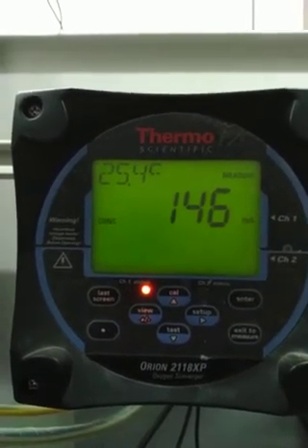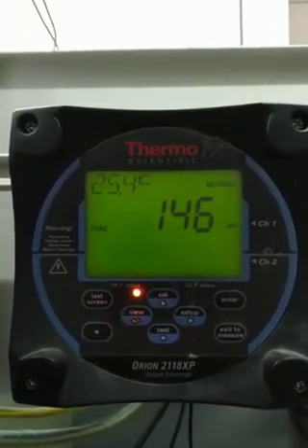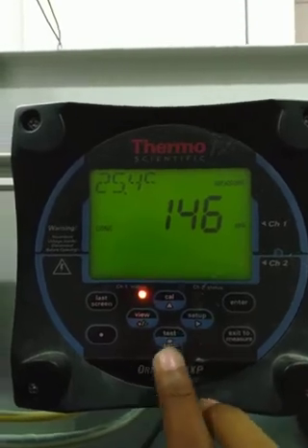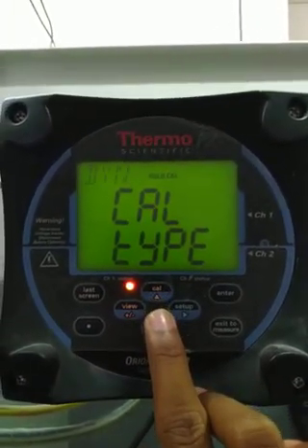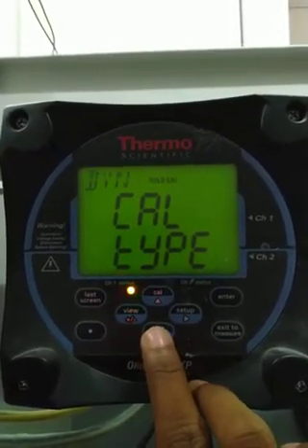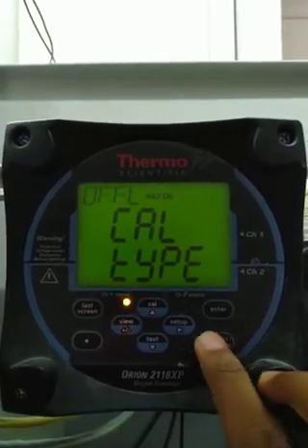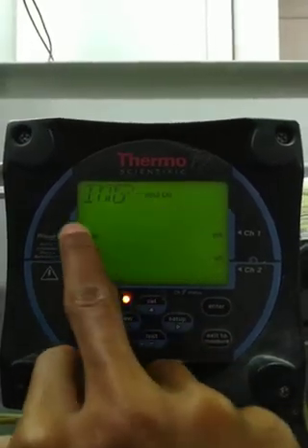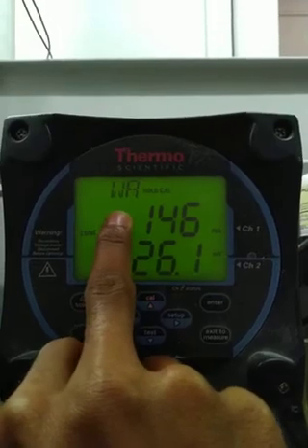This is not good, or you are able to set your own option. You can review the option which we are going to improve. After you do the option, the drain option would change. If you do the option, then you can choose to go to the option.